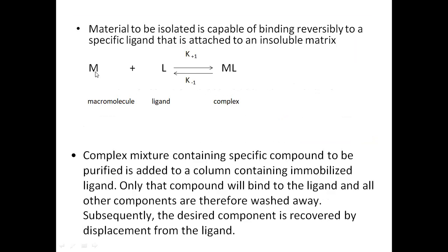This is a representation here. I have put capital M as the macromolecule, and L stands for any ligand which is complementary to the macromolecule. And then there is a kind of equilibrium. There is a complex formation between the macromolecule and the ligand.